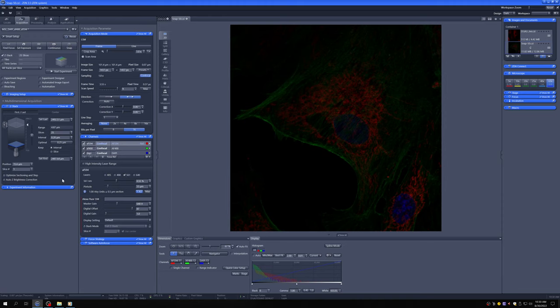And then what we need to define is what the bottom and the top slice are going to be and what interval we're going to use between the slices. So to define the top and bottom, it's very easy.